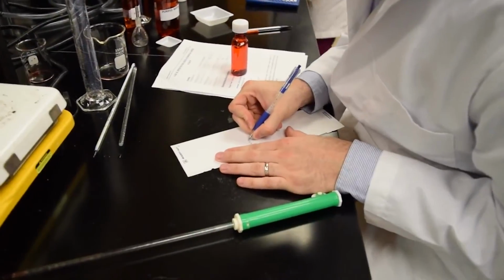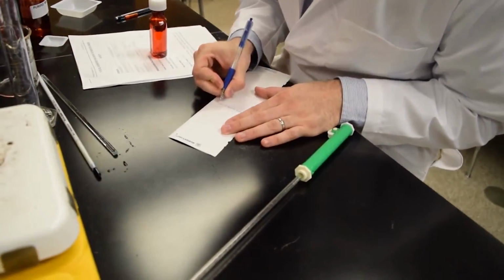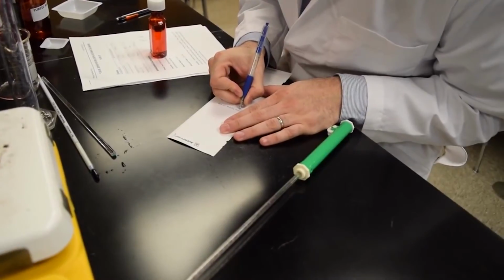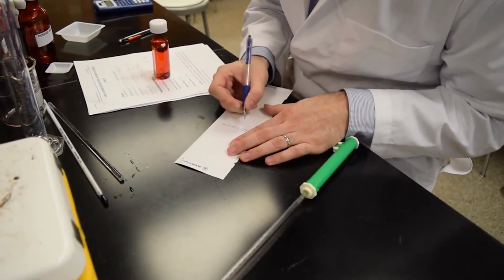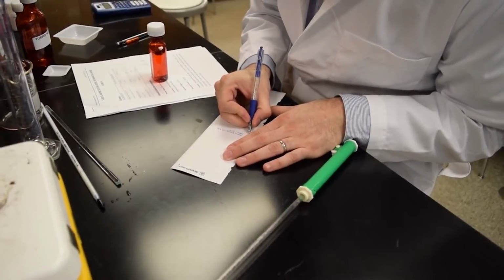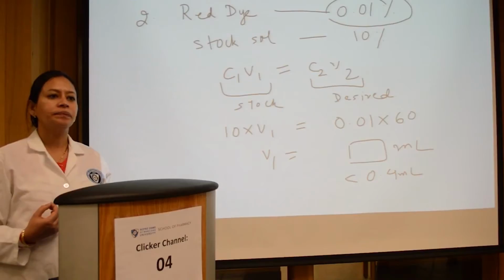So what are the labeling things that will be on the label? You will have the patient name, the physician's name, the date, the name of the product, the quantity in which you are dispensing the product, and report the concentration of the drug in milligrams per teaspoon. Okay? Any auxiliary information that is required? Yes.